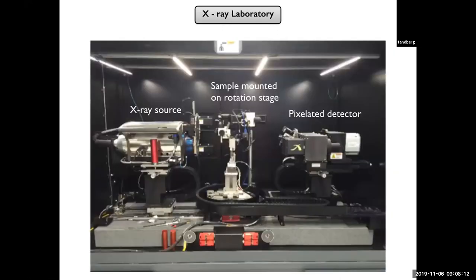So in the x-ray laboratory, here you will see the x-ray source that creates, that passes through the object and this is the rotating stage. And then we have the pixelated detector there that collects all the projections.